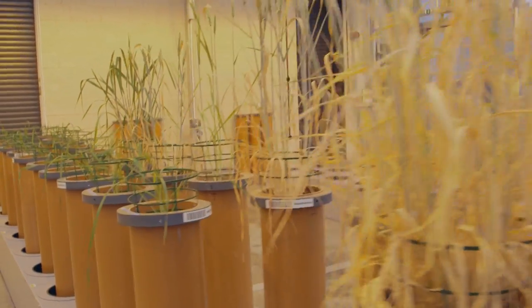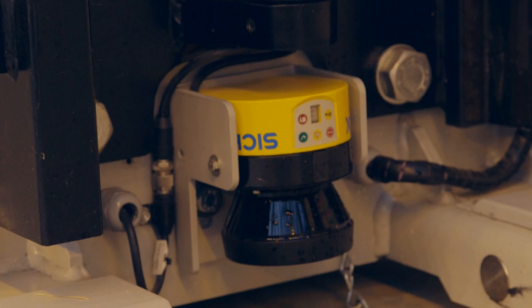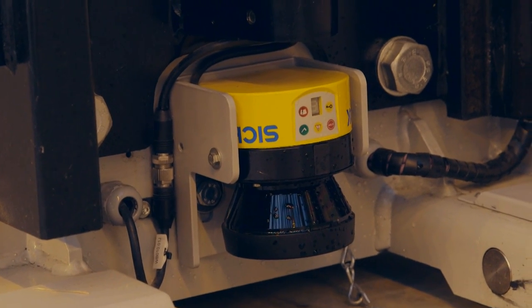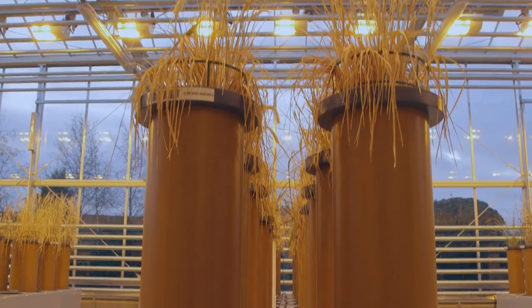We have a collection of wheat, maize, and we're about to do some barley. We look almost exclusively at food crops in here. There's a lot of space in here, basically because of the turning circle of the AGV. We have one that is normally used in manufacturing industry. To be able to lift the weight of these samples, they have to be a reasonable size, so we've ended up with one that has quite a large turning circle. It fires a laser plane out at about ankle height, and if I stand in the way, the robot will stop rather than run over me. These things are intended to be used in places that are occupied by humans, so we went for this because it allows us to have people working in here as well as the robot.